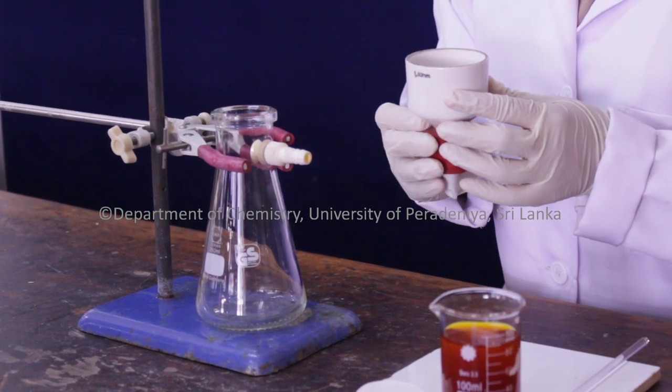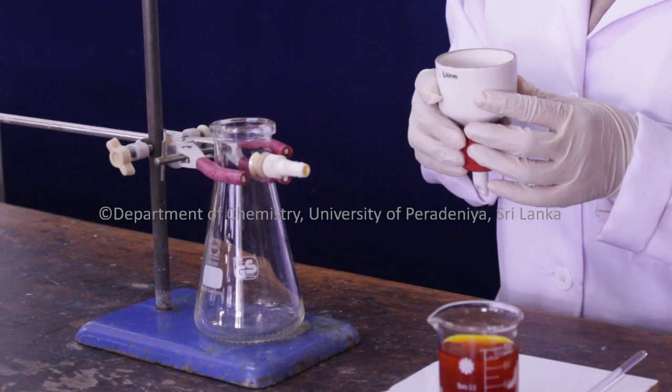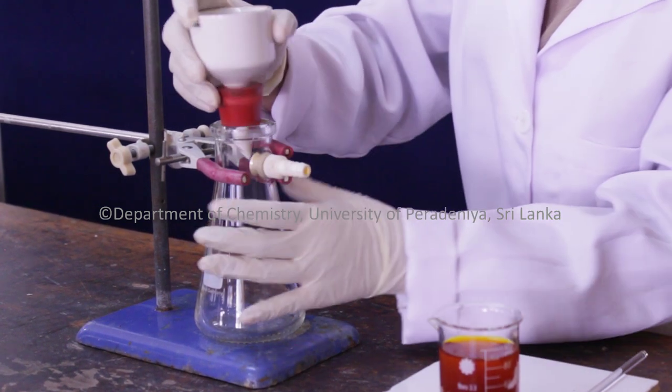Then we have to take a Buchner funnel and fit it to the Buchner flask in a way that there is a vacuum-tight seal.